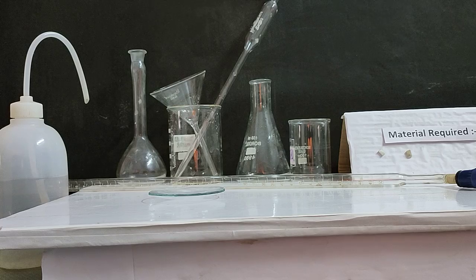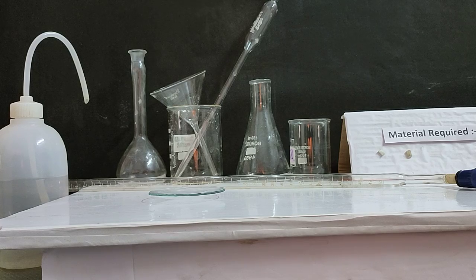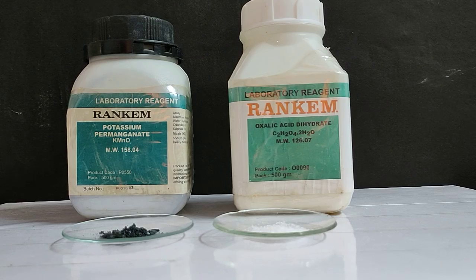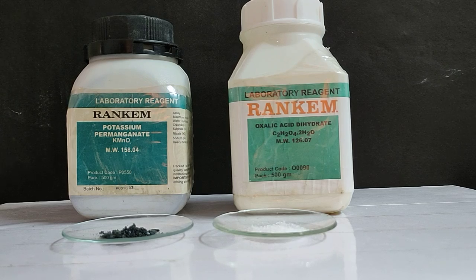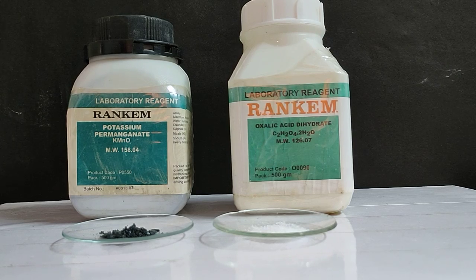Identify the other materials. Potassium permanganate: violet in color. Oxalic acid: colorless.